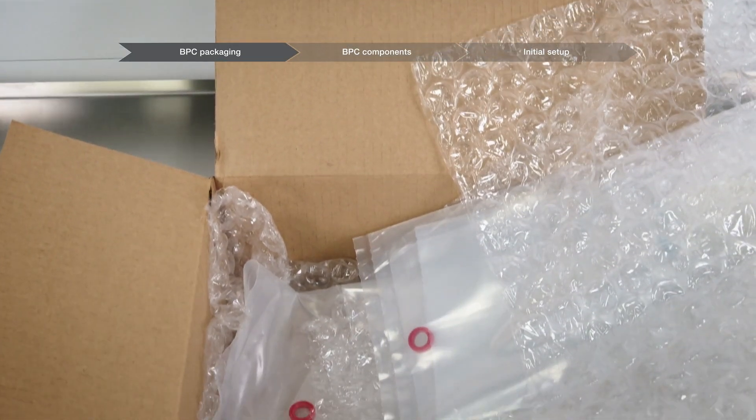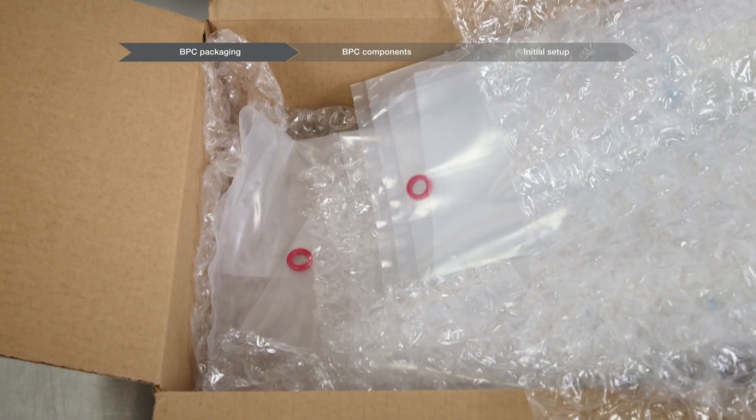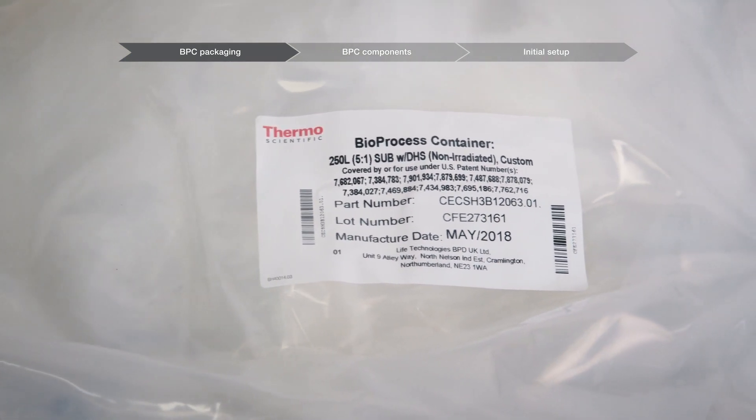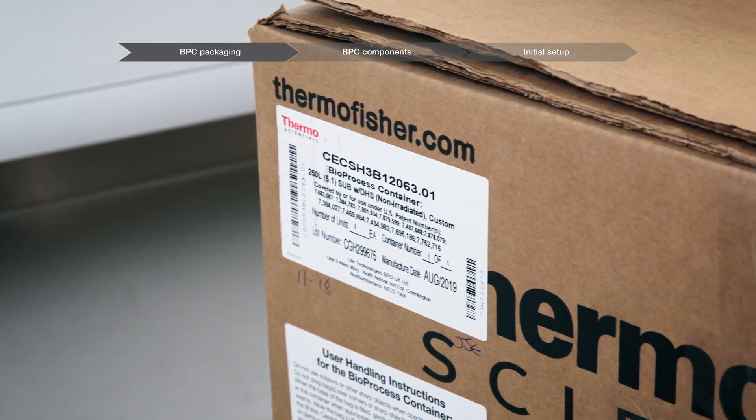The outer packaging consists of a cardboard box and bubble wrap. The bubble wrap is used to cushion products and is found on the bottom, between, and on top of the product inside the box. The product label is found on each BPC chamber or on the innermost poly bag, and may also be found on the outside of the box.